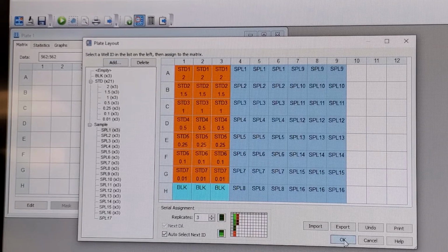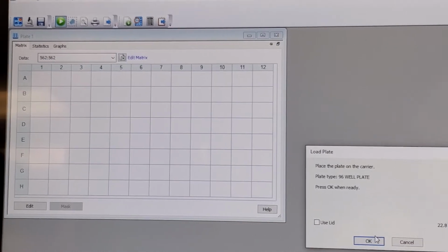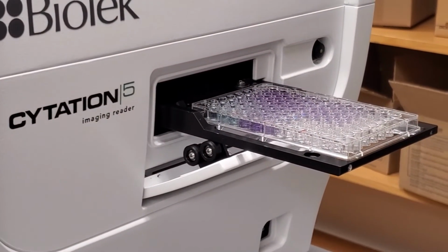I press OK, and once I come to the home screen, I go to this green button where it says read a new plate. Click on it and it'll say place the plate on the carrier, 96-well plate. Make sure that's what you have, and use lid. I don't have a lid, so I can remove that, and I'm going to press OK. Just note that my plate is already on that little hand of the machine. I don't really have to do anything.